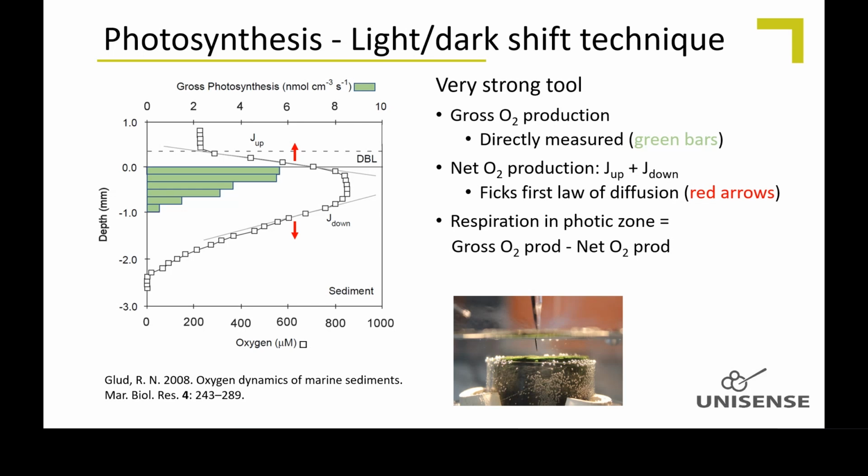But do you think I should measure the oxygen profile with the same sensor? Sorry, I mean, measure with the same sensor and then do the light dark shift right away. Yeah, that's how I would do it, so I'm sure that I have a very nice steady state profile, because if the profile is not quite in steady state, then the fluxes you calculate are not totally correct. Yeah. So thank you very much.